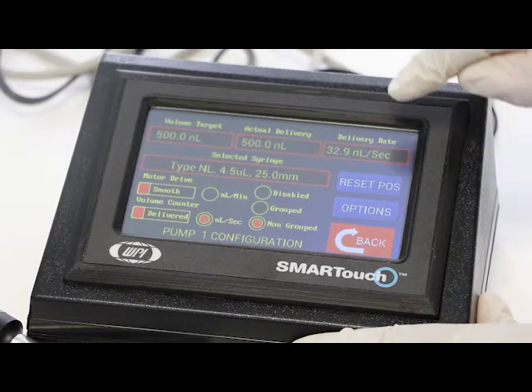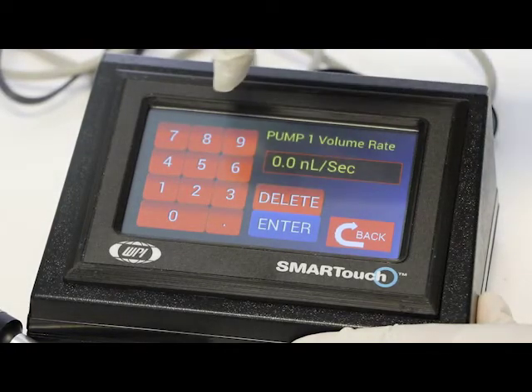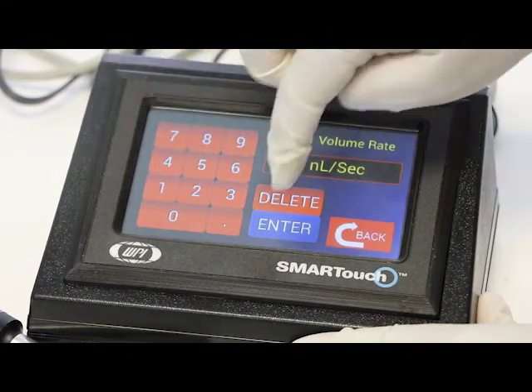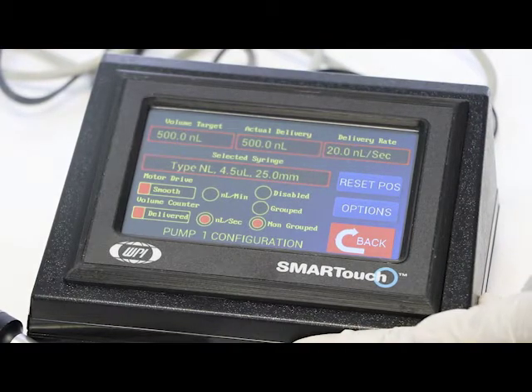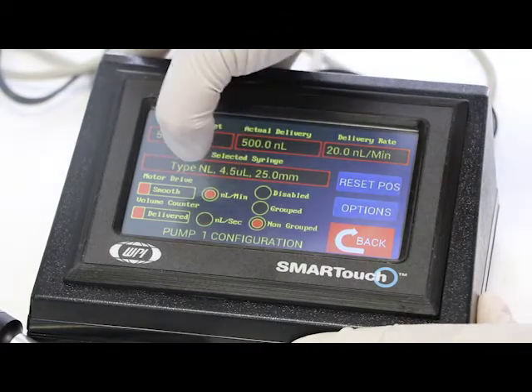Now you want to adjust the delivery rate. What's the nano-liter per second that you want to deliver or the rate that you want to deliver? 29 nano-liter per second. And then we have other options that you can use. You can either do it nano-liter per minute or nano-liter per second.